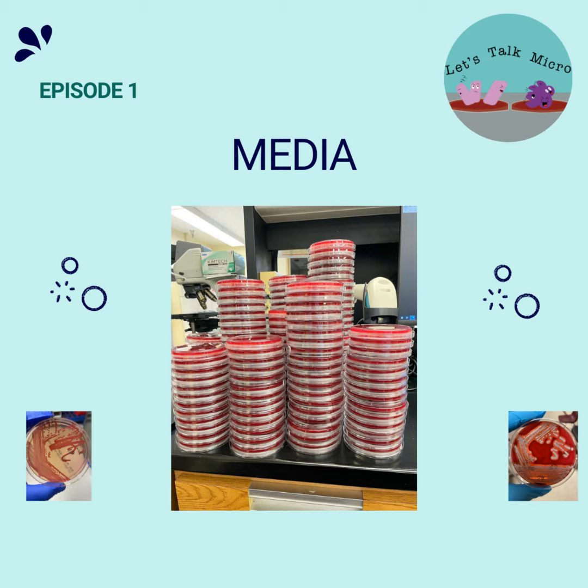And then we have differential media, which has ingredients that basically allow some colonies to exhibit some characteristics that make them different from other colonies growing on the same plate. We have two great examples: blood agar, which is differential for hemolysis, right? And what is hemolysis? It's a lysis of red blood cells. And there are three types of hemolysis. You have alpha, you have beta, and you have gamma hemolysis.